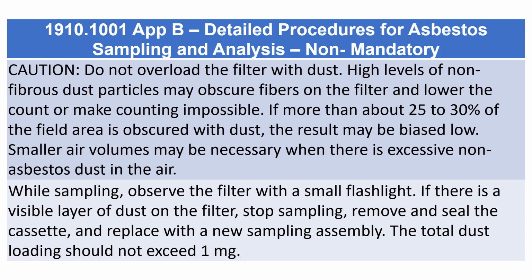While sampling, observe the filter with a small flashlight. If there is a visible layer of dust on the filter, stop sampling, remove and seal the cassette, and replace with a new sampling assembly. The total dust loading should not exceed 1 mg.